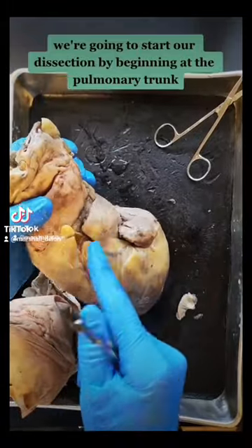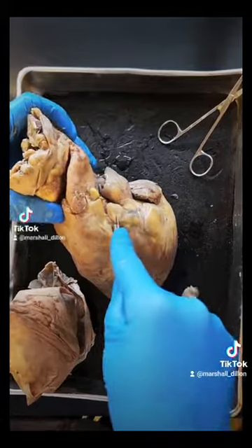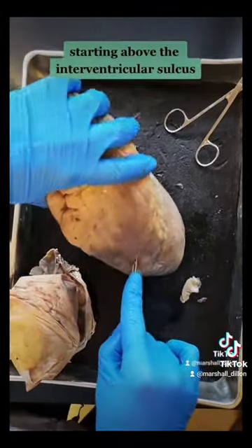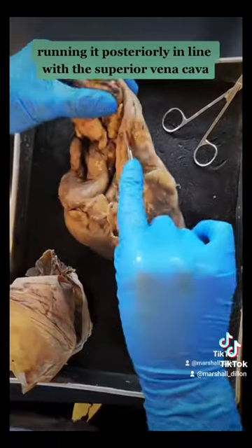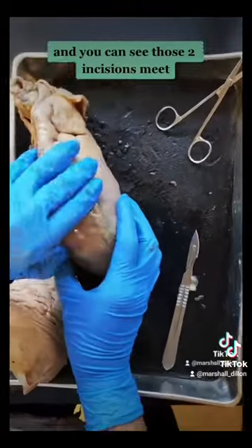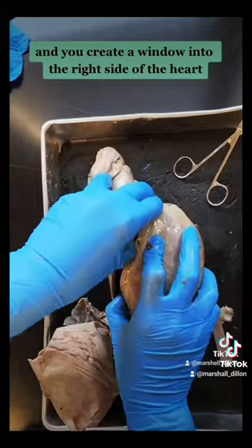We're going to start our dissection by beginning at the pulmonary trunk, starting above the interventricular sulcus, running it posteriorly in line with the superior vena cava. You can see those two incisions meet, and you create a window into the right side of the heart.